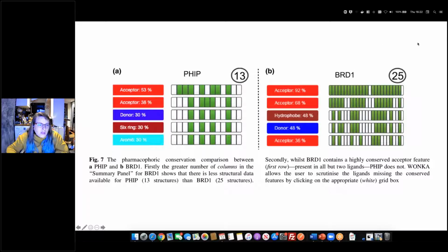And then finally, we've got the idea of clustering pharmacophoric features, which is the thing I explained on the first slide, where you can define all of the pharmacophores in your structure and use them to direct your design based on which pharmacophores are hit by which ligands, and very easily look across ligands to see which ones do and don't fulfill certain pharmacophores.